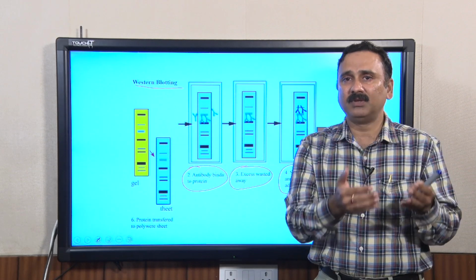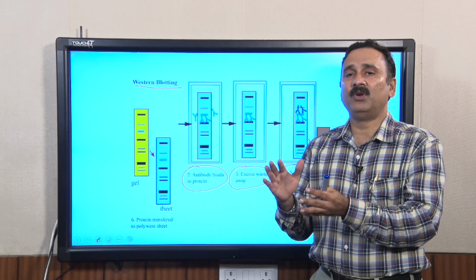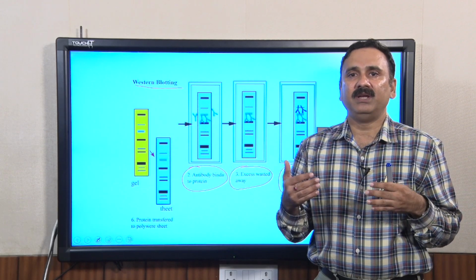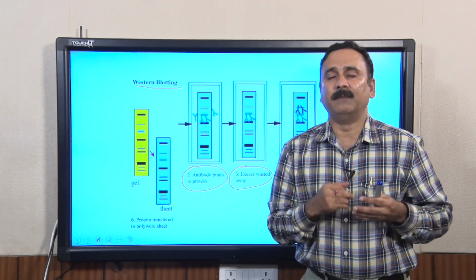And once you develop the blot, you are going to get the chemiluminescent signal, and that also can be evaluated using different types of image analysis software.